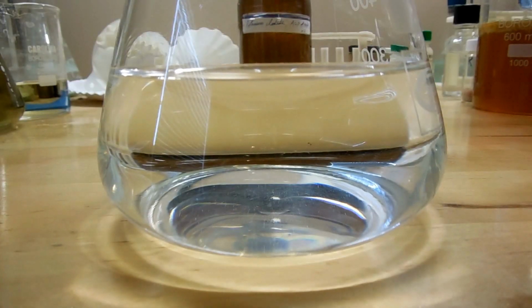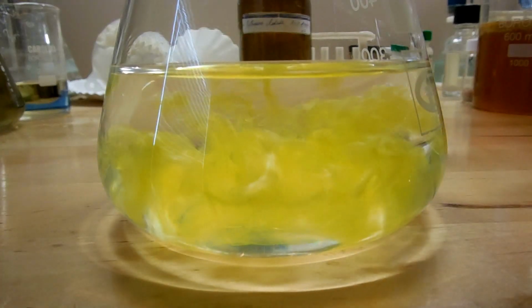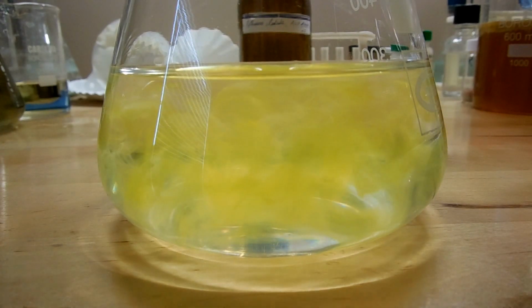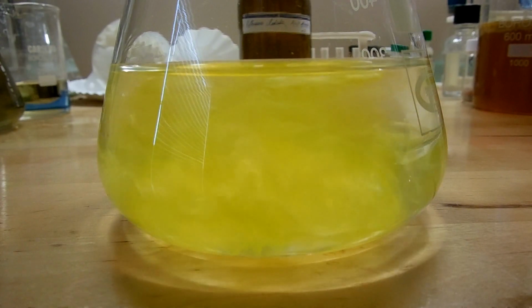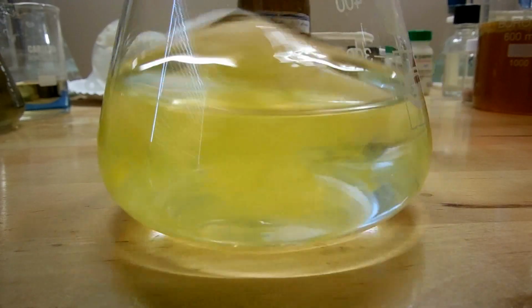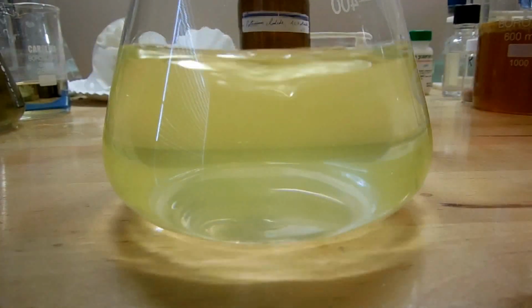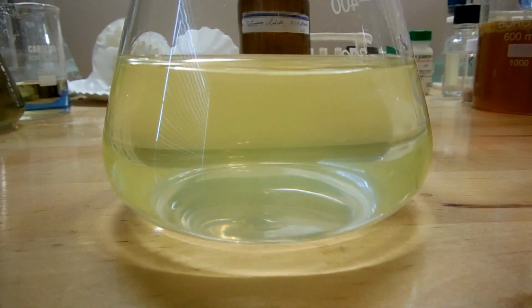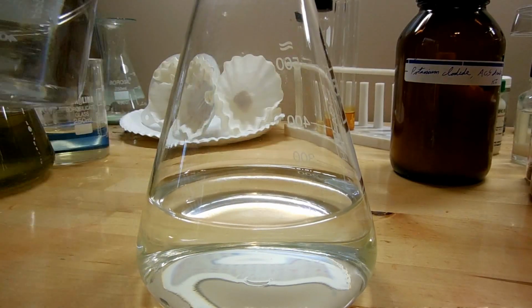Man, that's pretty. I rearranged a little bit to get a different angle, so let's try this again. That's a really gorgeous yellow. You can see now we're starting to reach the solubility limit of this, which is very, very low solubility at room temperature. All right, let's take all the rest of the potassium iodide and add it directly to it. This should be pretty cool.